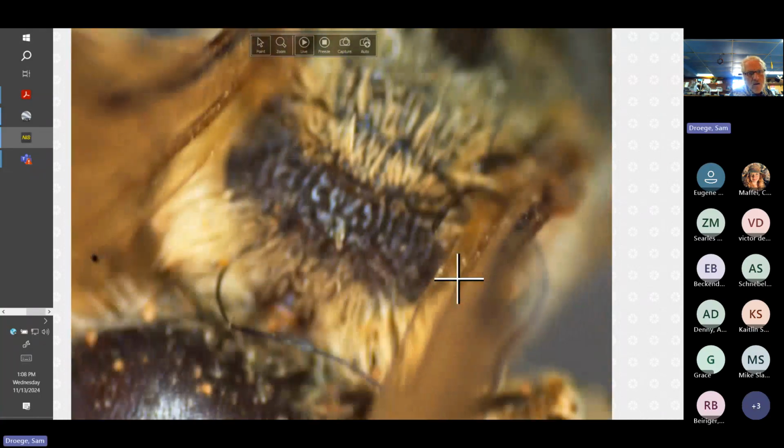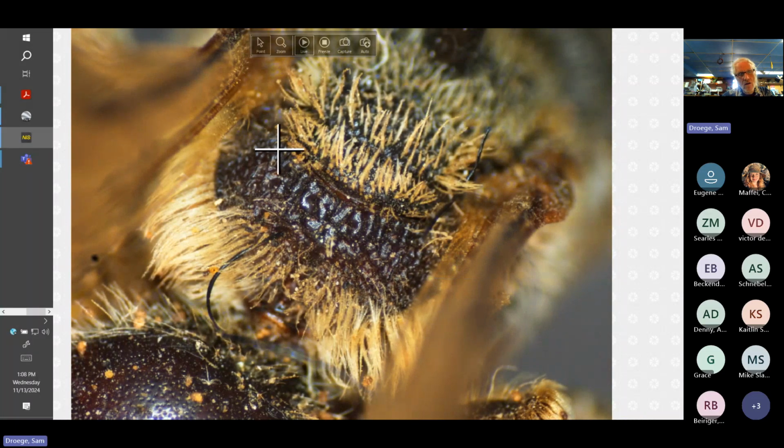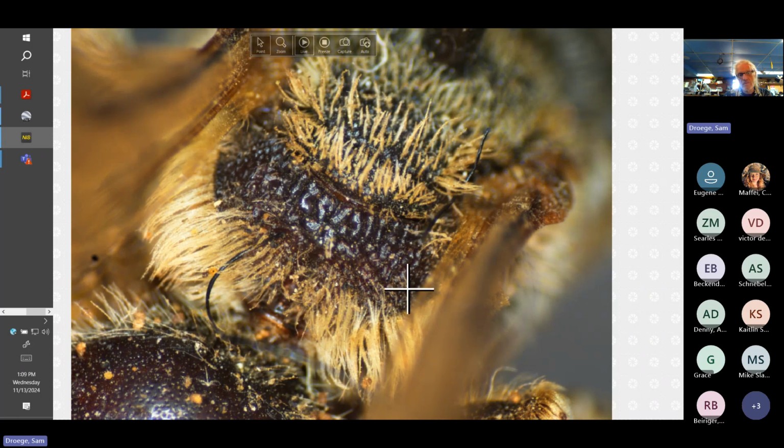Leave it at that for now. And most of you are propodial triangle experts now. So you can see that the propodial triangle is using from this suture line where we have the scutellum, the metanotum, propodium. Propodial triangle is this usually well demarcated triangular area that is dorsal or on top of the specimen. And then you have lateral faces and rear faces to the propodium. And this triangle usually is crisply differentiated from the lateral sides.